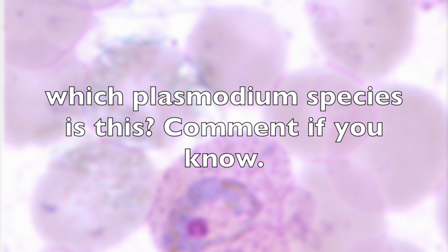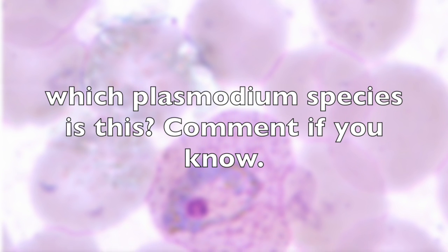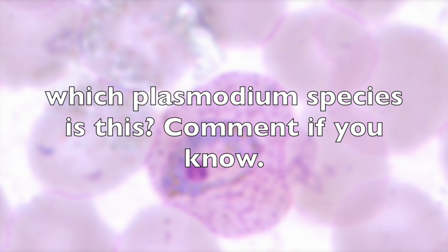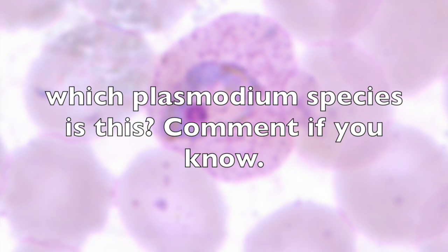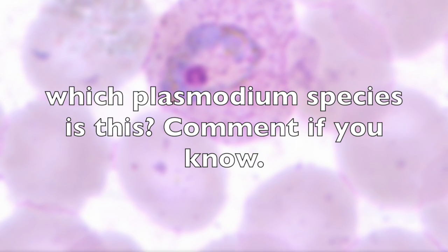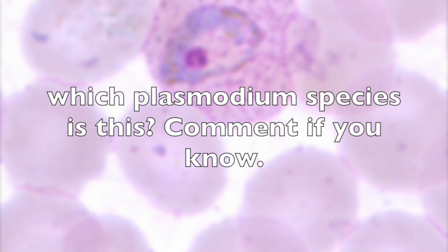So hands-on in the lab, you prepare the parasite culture and you synchronize the parasites, again at ring stage. This allows for consistency of readout. If you have a mixed culture where some parasites are at the trophozoite stage and some at the schizont stage, then you're going to get mixed readouts. So you want to synchronize them to one particular stage, and usually it's the ring stage.